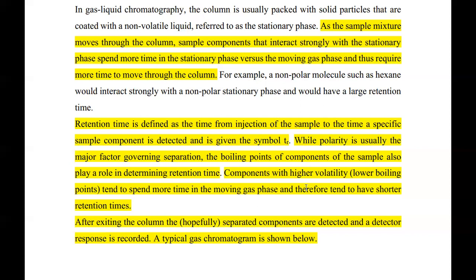So what we are saying is that some of these components may be in solid form. I talked a little bit about the temperature within the column. Some are able to boil, and once they boil, they change into a gas, changing their state. It depends on the boiling point of the component that you are separating.